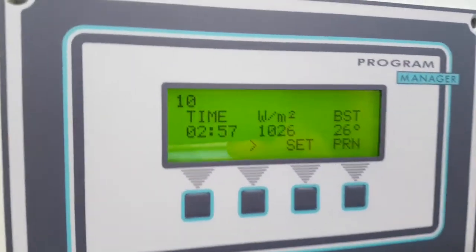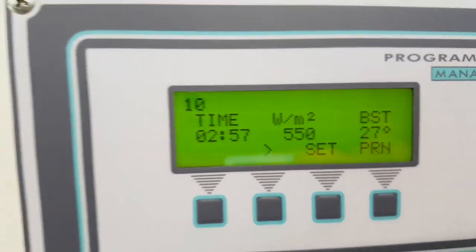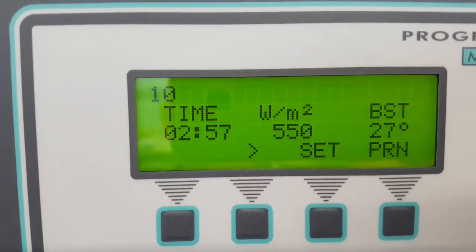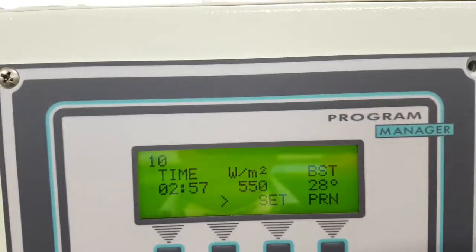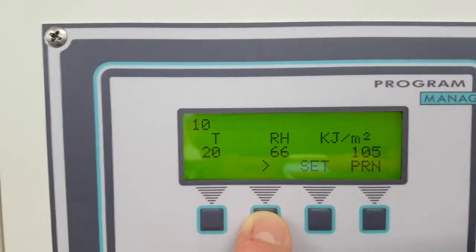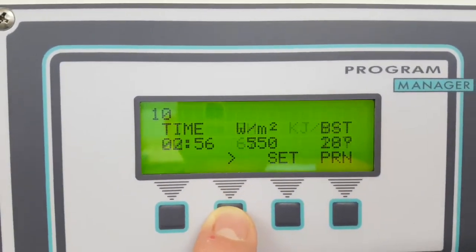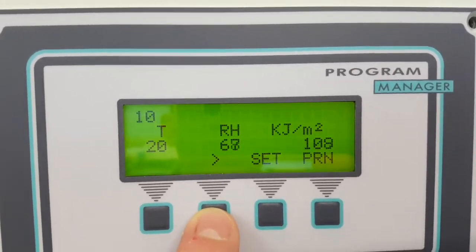You can set the time of the test, the power of the lamp in watts per square meter, and the BST temperature. Then you can select the temperature, the RH value, and the KJ of the test.